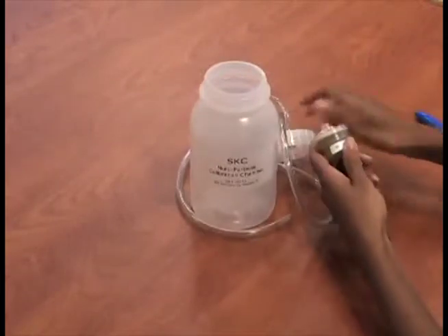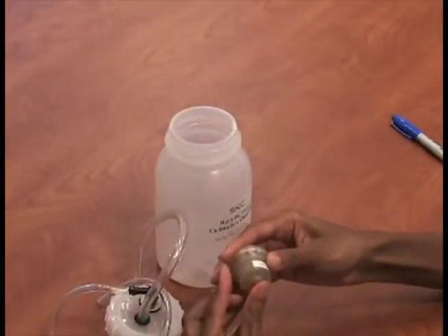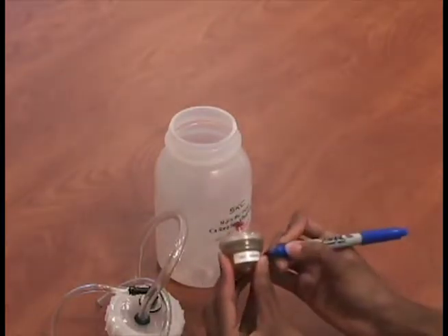After calibration, remove the DPM cassette and replace the nibs on each end. Mark it for use in the post-calibration you will be performing after sampling is completed.